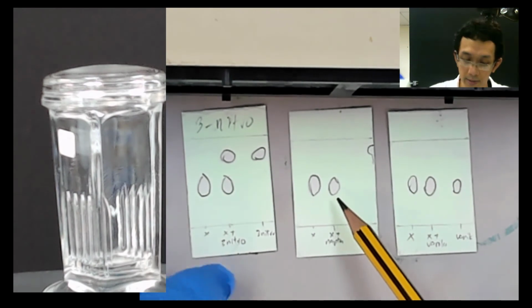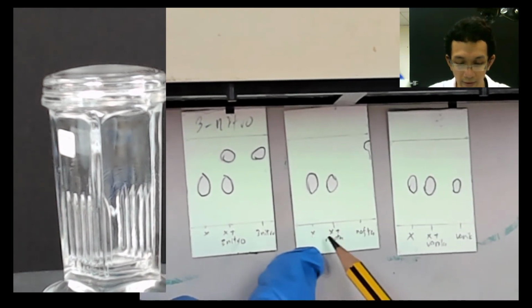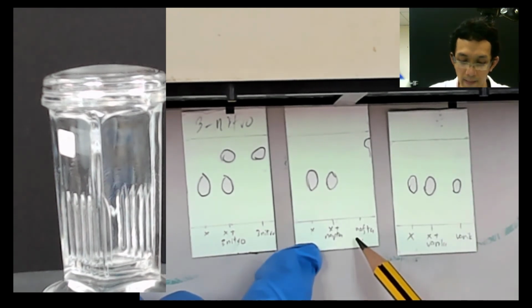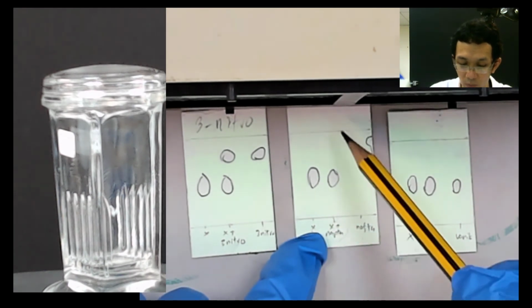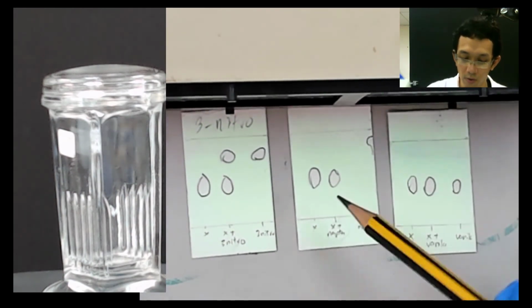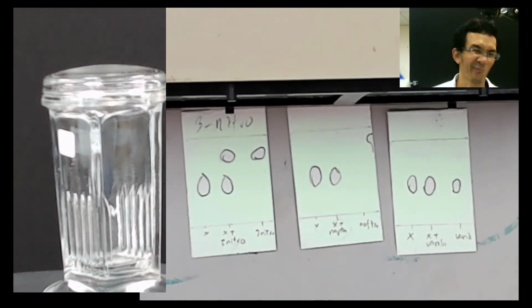If you see like this, okay, I put on the thing. If you see like this, it's as if the X is naphthalene. But the correct answer is vanillin. Because you see the naphthalene is here, but here there is no naphthalene separation. You combine X with naphthalene, but where is the naphthalene here? The question, why are there no naphthalene around here? There is naphthalene here. Where is it here? Why is it missing? Anyone? Question? We are at the end now. So anyone?